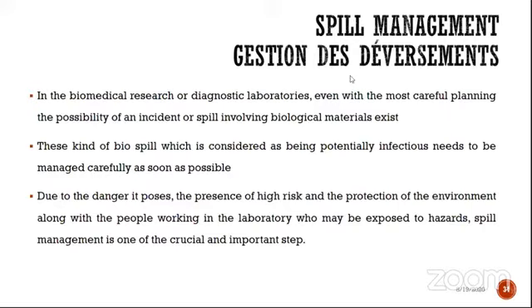So, spill management, another very important area. And basically, this is important in the case of COVID-19 as well. As you all know, if we are dealing with different types of samples and spills occur, these biological spills carry potential risk of exposure to disease.